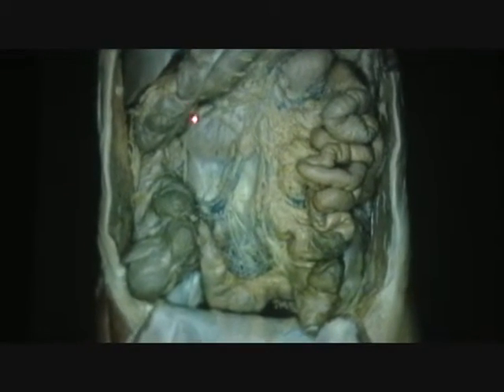If you're really good, you could tell me what that is. What do you think that is? It's the right kidney. That's what we'll pick up on after next week. Thing is, the kidney is underneath this layer. What is that layer? That you could tell me. Now it's a little cloudy. Should be much clearer.